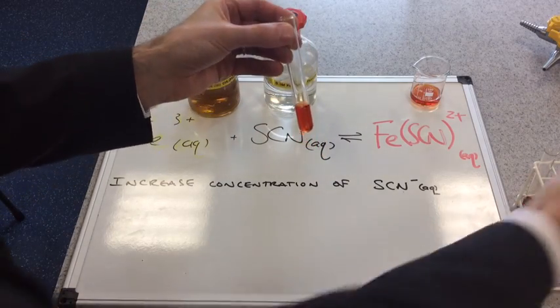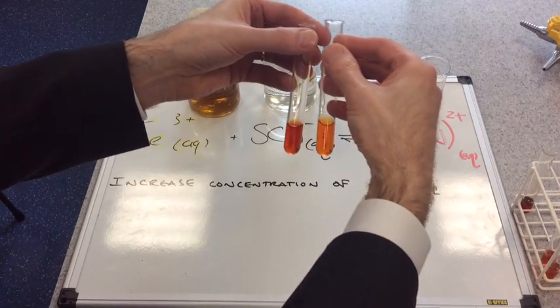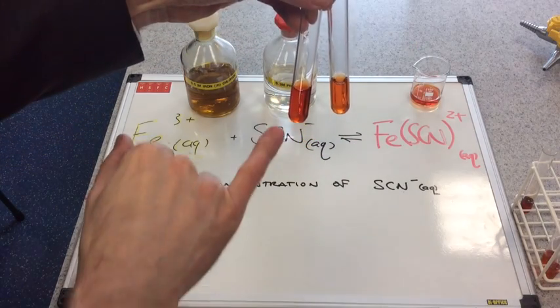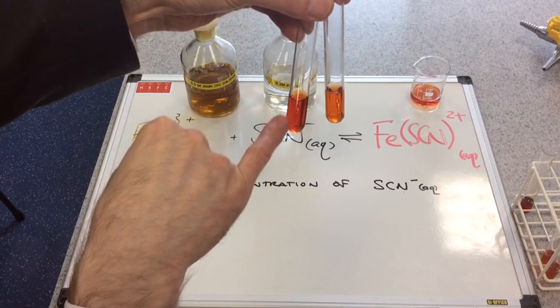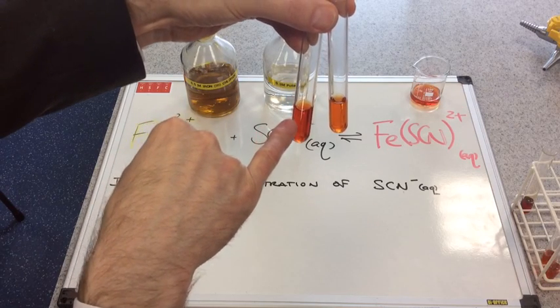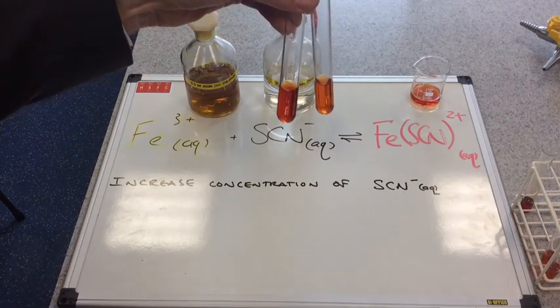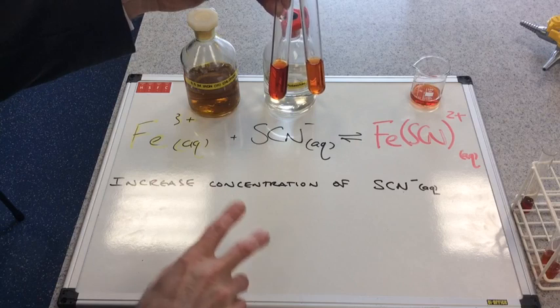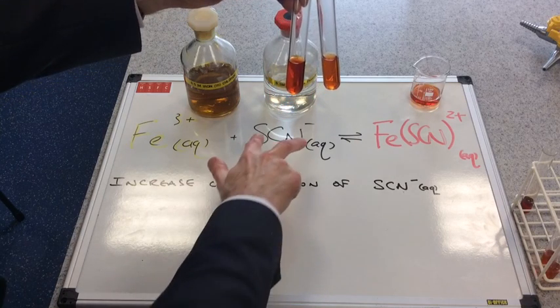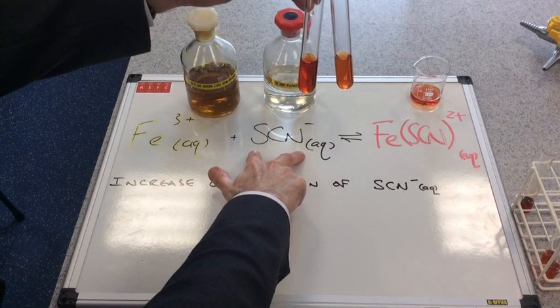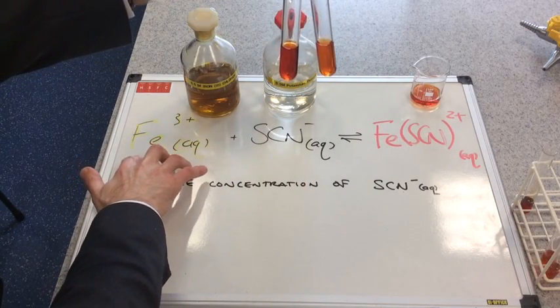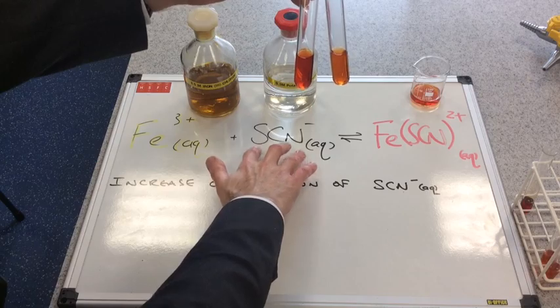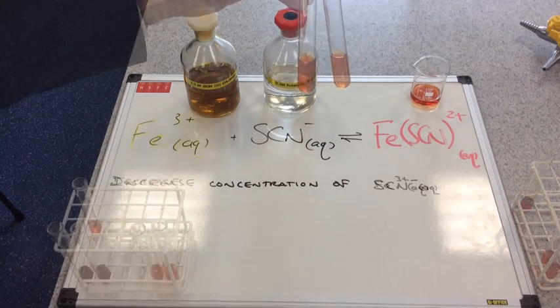So there's the test tube. I'll bring the control back. And hopefully you can see that the tube that I've just added the drop of thiocyanate to is darker than the control tube. So that means the equilibrium has moved to the right. It's the same argument as before. We've increased the concentration of one of the reactants. Therefore, iron 3 plus ions react with these extra thiocyanate ions and therefore the equilibrium shifts over to the right.